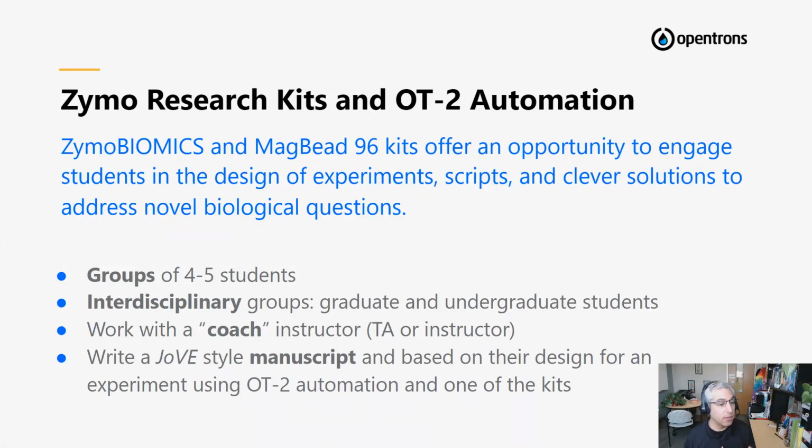And these include, if you haven't seen them, videos with the researchers walking through a procedure. And it allowed us to bring instrumentation we don't necessarily have access to, so new technologies, new liquid handlers, as well as bring liquid handling and robots and really great science online.